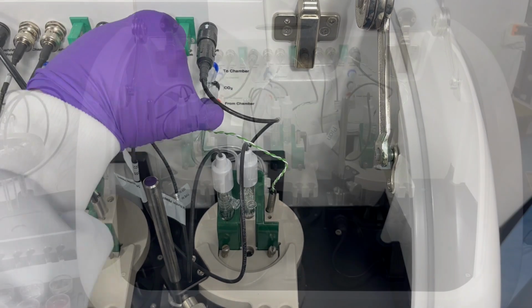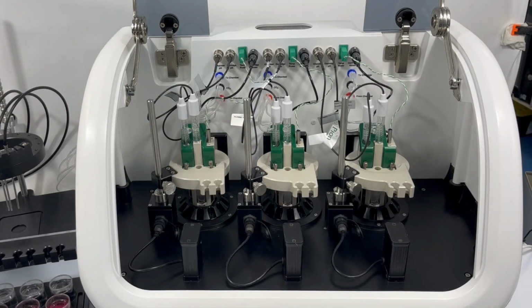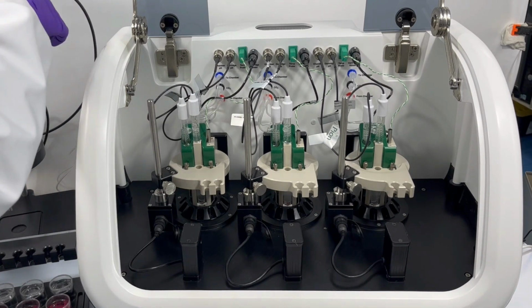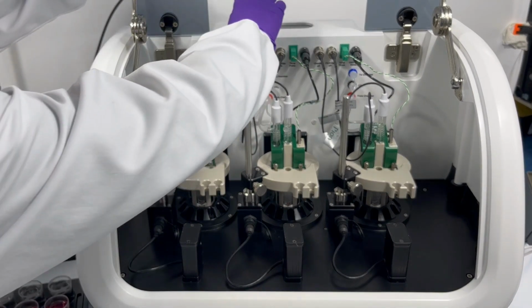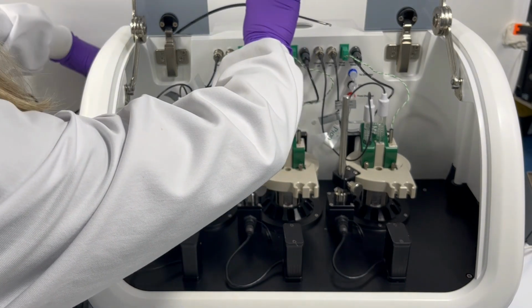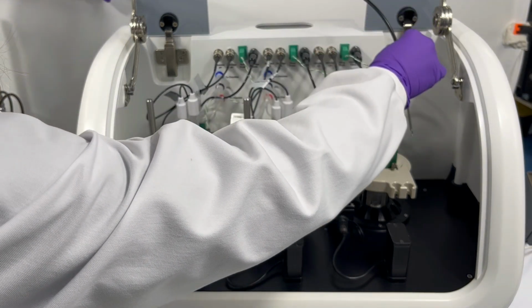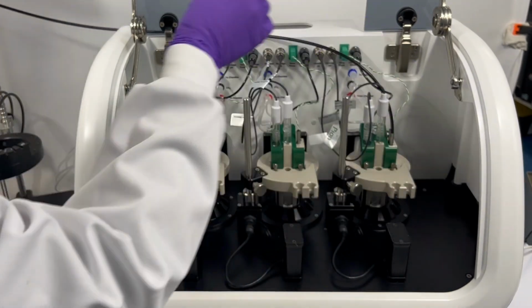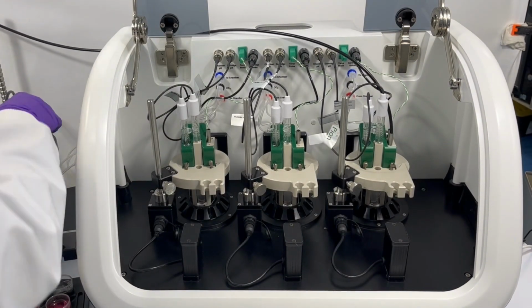And next we're working with our external Rainbow fiber optic system, where we want to use this system to monitor the concentration in real time inside the chamber. So we want to see how much of our API is released out into that chamber. And to do this, we'll use the in situ UV fiber optic probes, which come with the system.